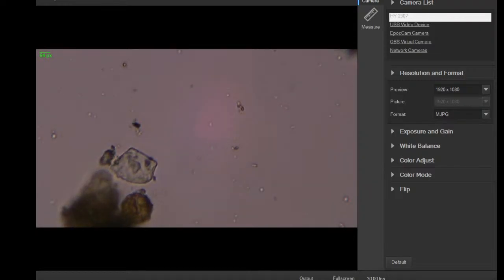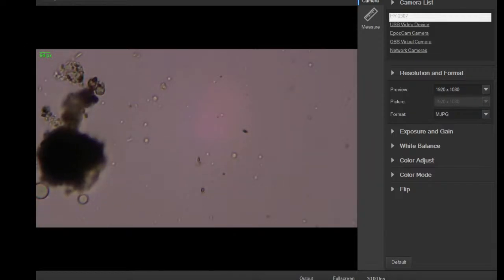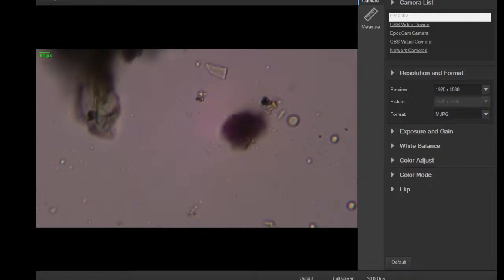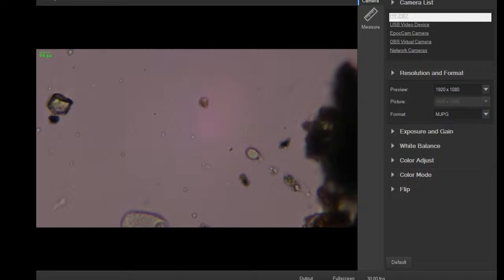More bacteria jumping around here. There's a whole bunch of little guys there. Those little spheres, they call them cocci, like streptococcus. Little spheres and other smaller dots bouncing around. Tons of bacteria on the slide. I'm not seeing any more big thingies. I'm not seeing any eukaryotes, just prokaryotes.